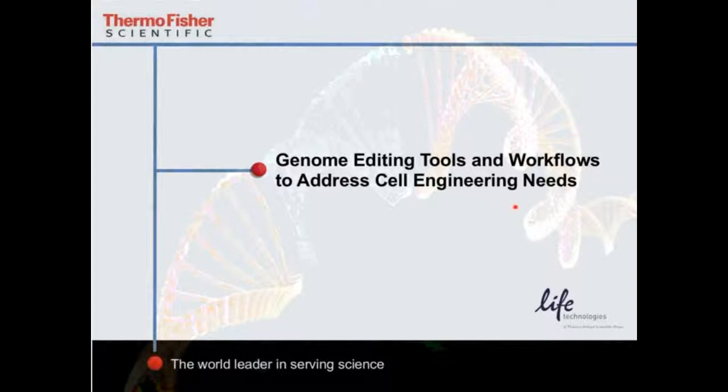Today, we're going to talk about some of the genome editing tools and workflows for cell engineering that we've been developing at Thermo Fisher.